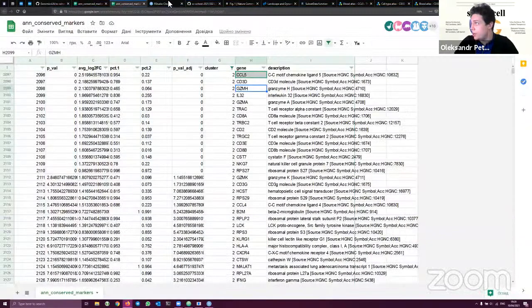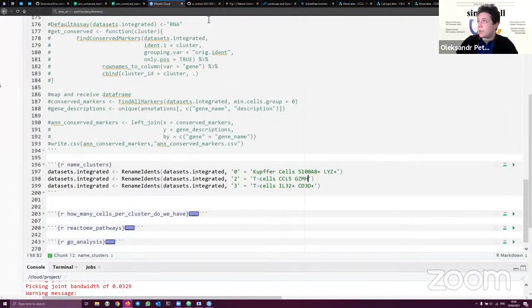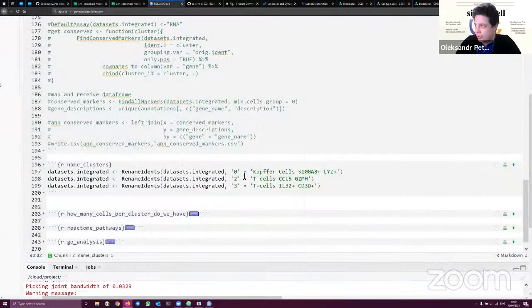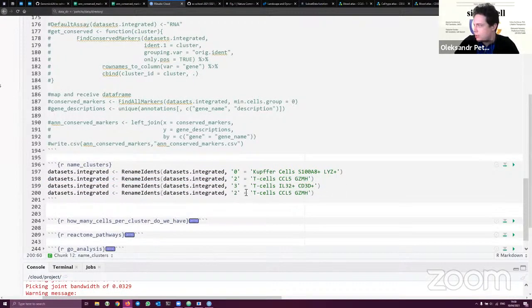However, to be sure, I don't see anything more specific here. So in this example, we can also write the markers, so we identify them later. So Taras writes that cluster 7 are probably Tregs. Let's just put it like that.